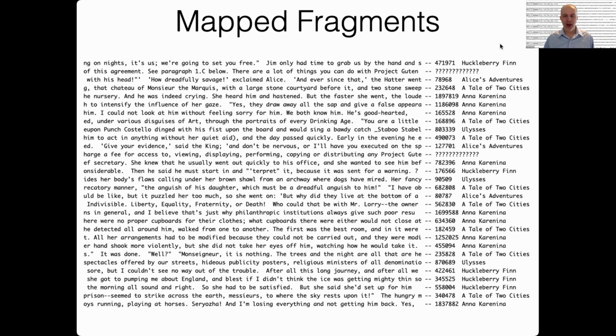So, we've done that for all of these fragments. Remember, each of these lines here is a separate fragment. And so we've been able to match all of them. Well, so actually not quite all of them. I'll tell you that when I generated this example, I made a little bit of a mistake, which I think is actually a really useful mistake because we get the same thing with real data.